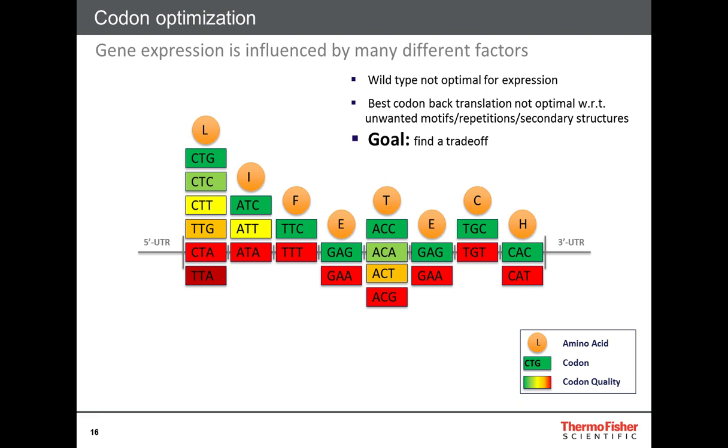So how did we solve that problem? I show you here a short animation of how our algorithm basically works. You see that our algorithm for this short peptide would come up with the most preferred codon for almost all amino acids, but the threonine is coded by the second most frequent codon. For what reason? In this specific case, I don't know.